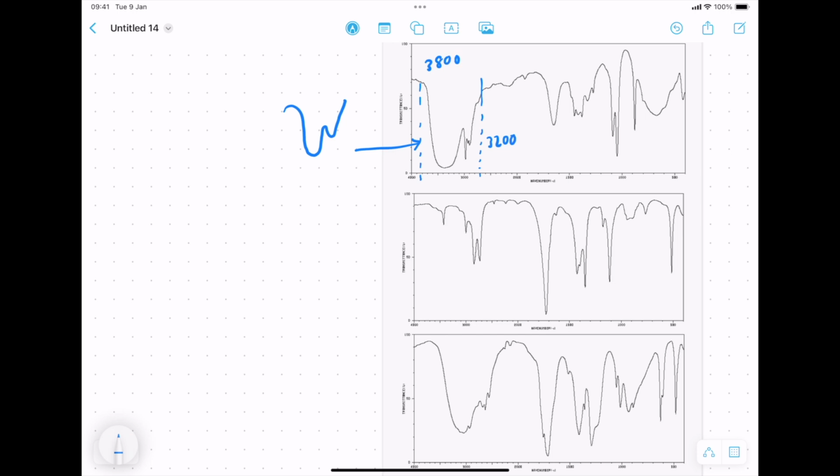Right? When you see that, this idea of what I like to think of as a double dip, it is always the same functional group, which is an alcohol. Okay, so whenever you see this double dip, it is always an alcohol. Now, granted, sometimes it may be more extreme and it may go up like that and then come back down, but you'll always see this drop, move back up, drops again.